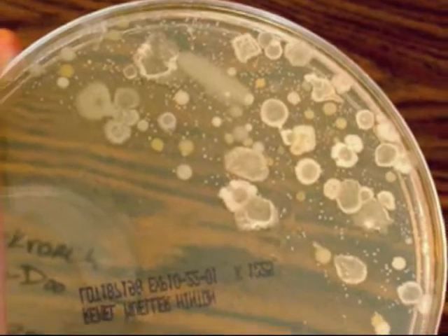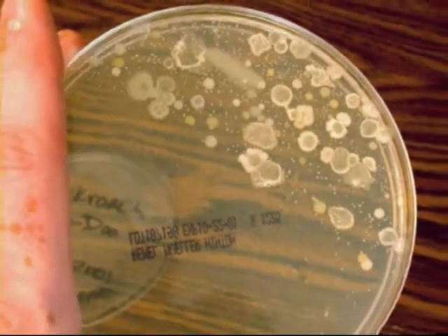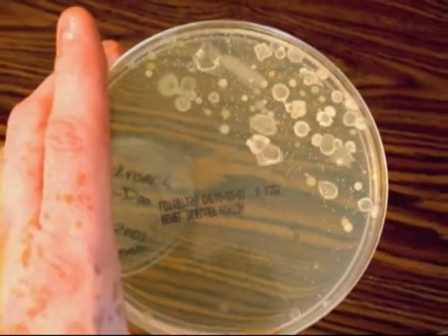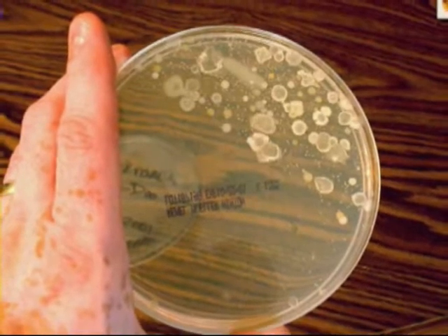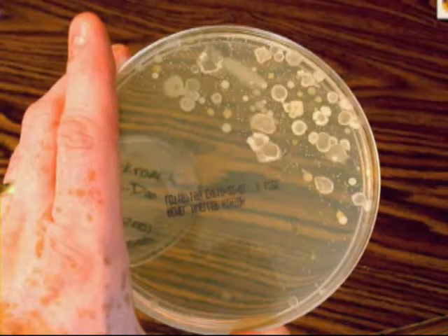And now, if you look on this plate that's been incubated 24 hours, it's just full of colonies of bacteria. Millions upon millions upon millions of bacteria. It doesn't mean they're pathogens, but they certainly are bacteria. Each one of these colonies represents one or more bacteria that were seeded onto the agar and then it was incubated.